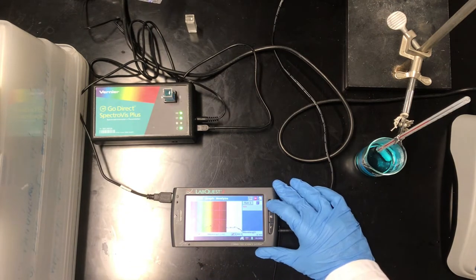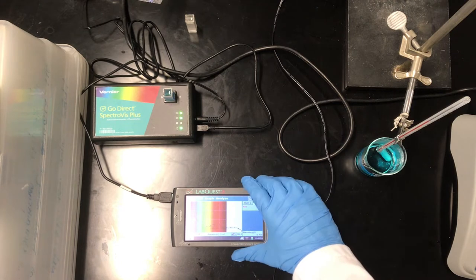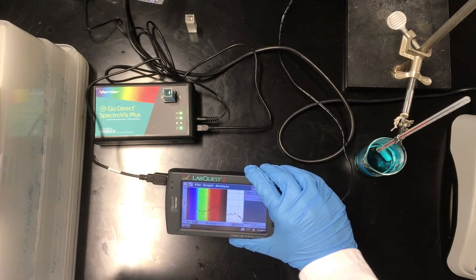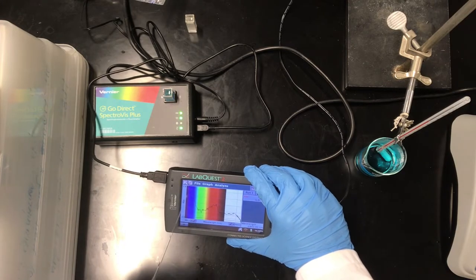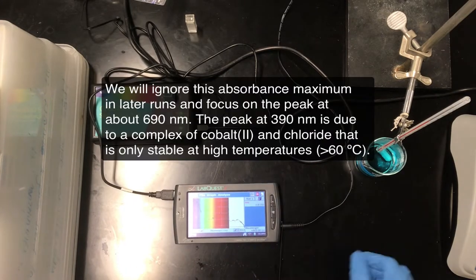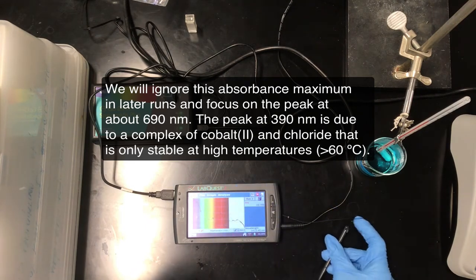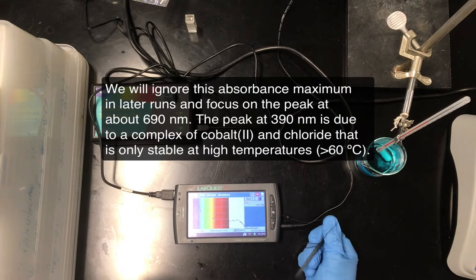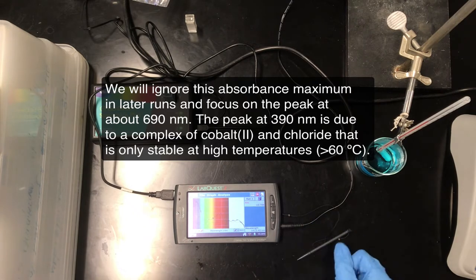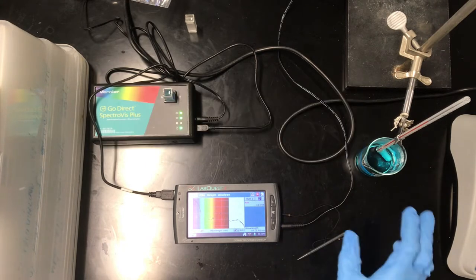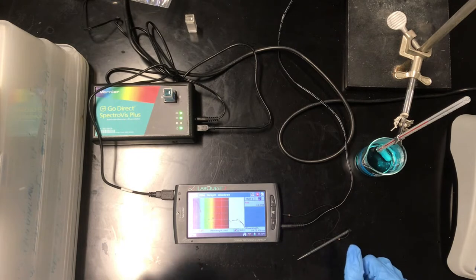So here's the spectrum. I'm going to go ahead and hit the play button to stop it, and we can see that it's got an absorbance maximum that's down about maybe 390 or so, and we can go ahead and tap on that to see what the absorbance is there. And now we're going to give this, and by the way that number is about 0.708, and the temperature has decreased a little bit, let's call it 65 degrees Celsius, and now we're going to wait for this to cool a little bit and measure the absorbance again.